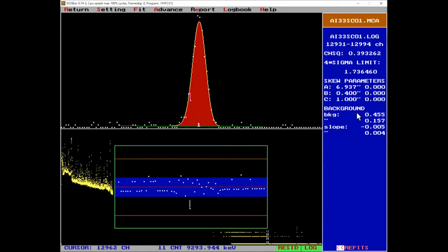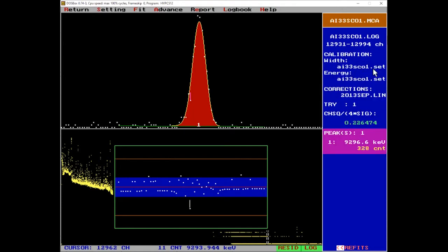And the merit of the fit is this so-called chi-square number. So if we do nonlinear least square fitting, then it can be proven that this chi-square has an expectation value of 1, and you can also calculate its uncertainty. So the program displays you this quantity, which is a transformation of this chi-square.